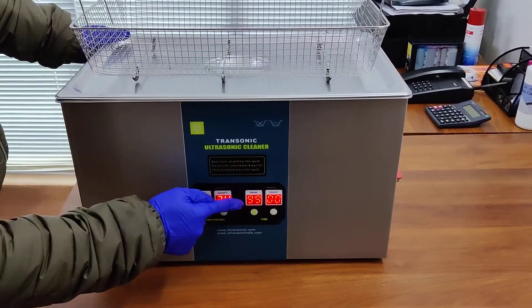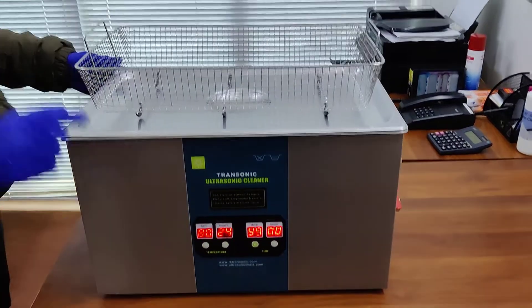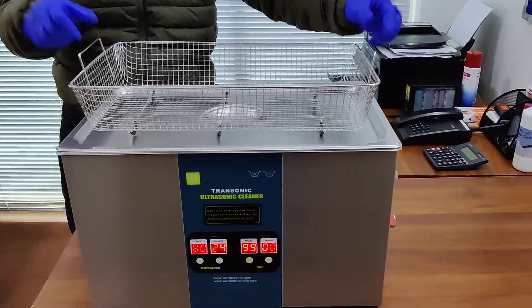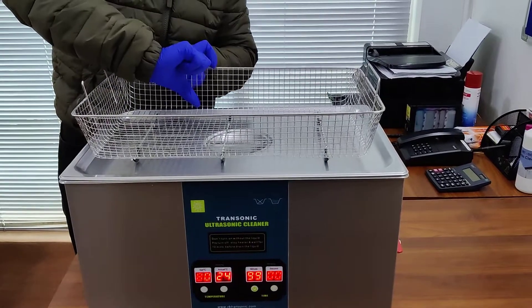There is a digital timer also. The maximum cleaning time can be set from 1 minute up to 99 minutes. The machine comes with a stainless steel basket. The size of the basket is 18.5 inches by 11.5 inches by 3.5 inches in height.